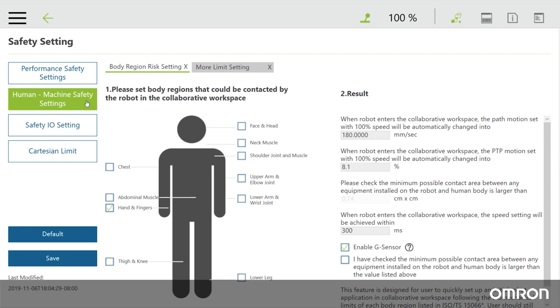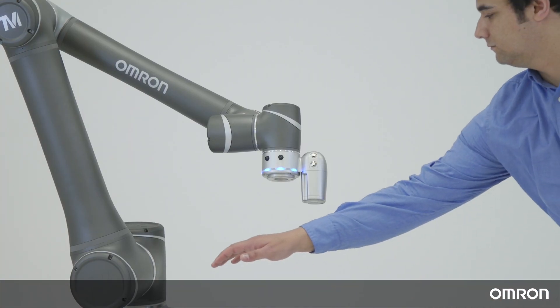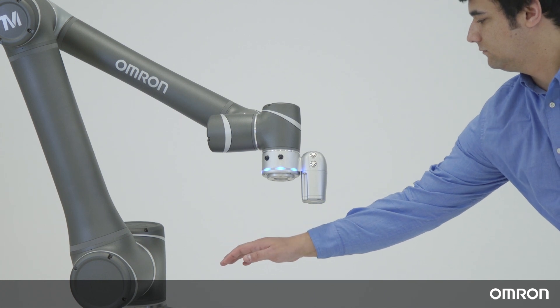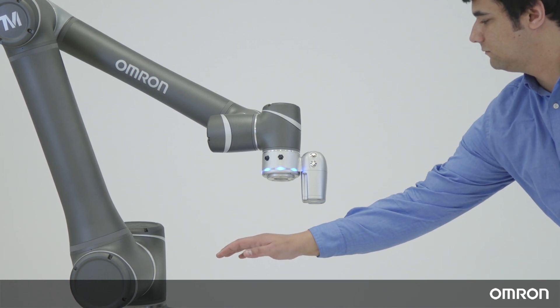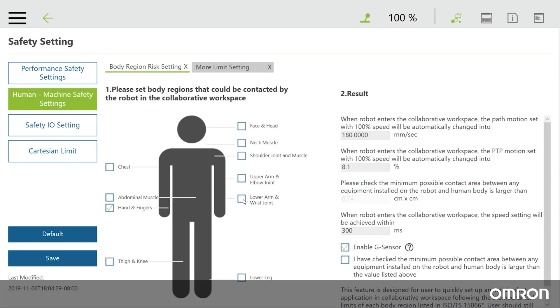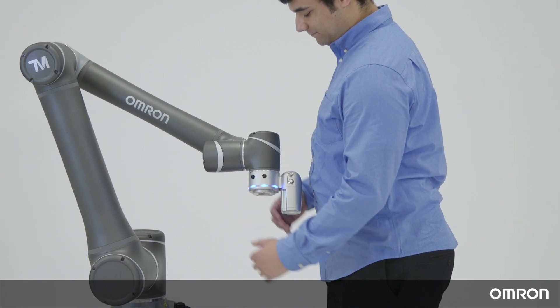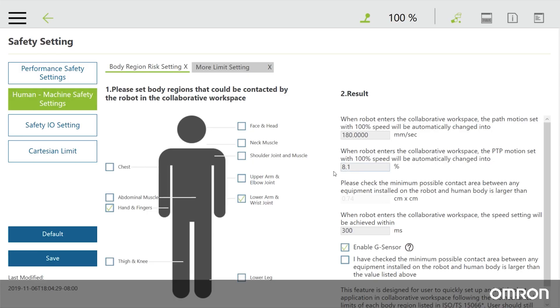This is the safety setting interface. First, let's talk about the human-machine safety settings. This is the safety settings for the OMRON TM robot when it is intended to work in close proximity with people. For example, if in your application it is possible that a person's hands and lower arm can come in contact with the robot, you can click those two sections and see that the maximum absolute speed and the percentage speed of the robot have automatically been set. On the other hand, if the person is to work closer to the robot, other regions of the torso such as the shoulder or upper arm may come in contact with the robot. Since these parts are able to take even less force, the robot's maximum speed is reduced further to prevent injury.